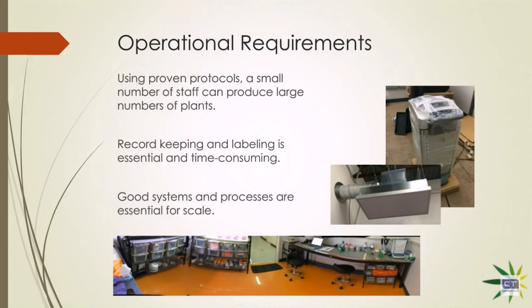Here's something we didn't answer or we didn't touch on. I think this is a great question. How long on average does it take from putting an explant into culture to establishing it into veg? And I think that's always that big question. And so what's our answer here for our audience? It's highly variable based on cultivar. I did mention that earlier, I think. Some really liked being treated poorly in this way, and they grow. And then others that are otherwise very robust growers in production were very reluctant to grow under these conditions. A range, 8 to 14 weeks.